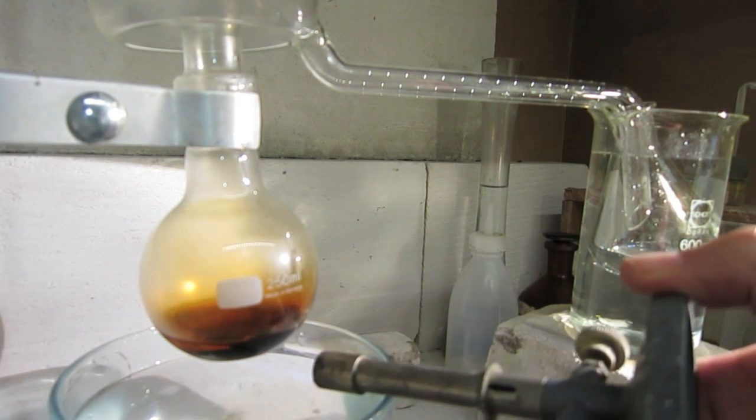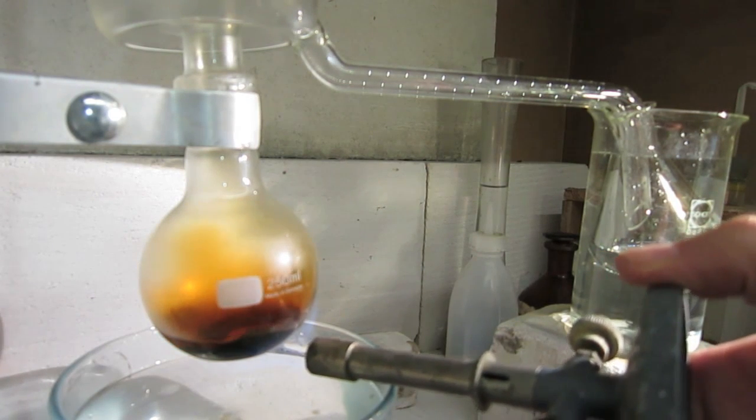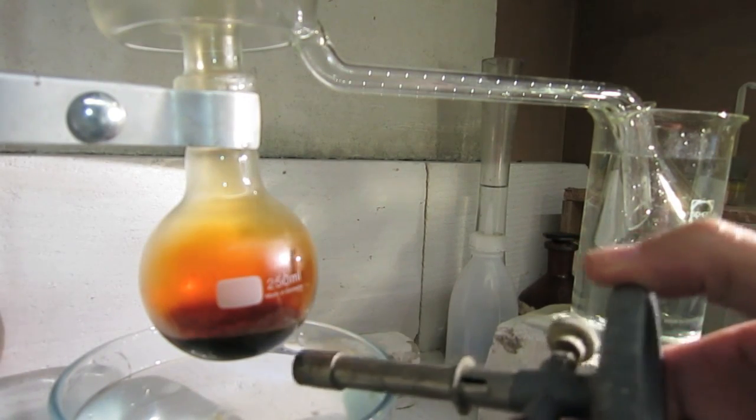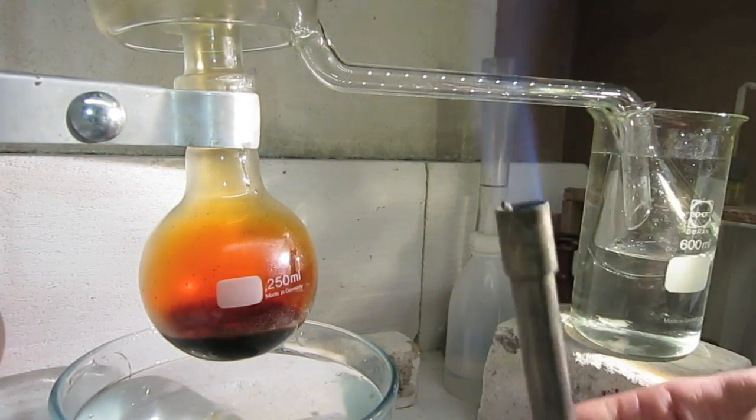And now you see the bromine, and very clearly the red, reddish brown. You see the bromine appear on the bottom of the flask.